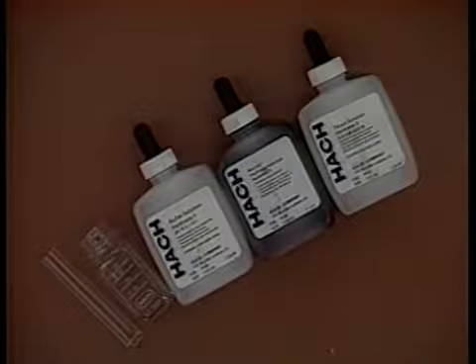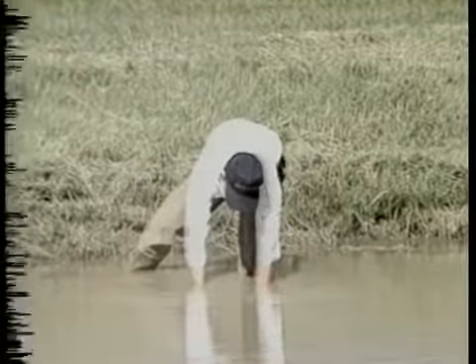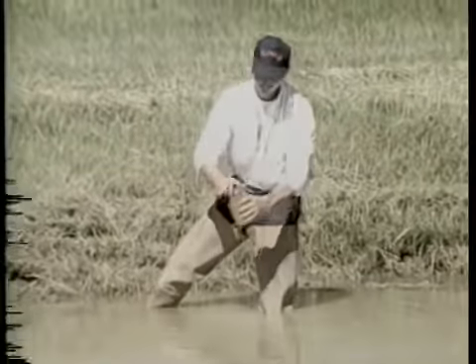Total hardness is measured using a test kit as well. To measure total hardness, proceed as follows. First, obtain a water sample from the pond in the same manner as the alkalinity test. Remember, use a clean sampling jar or bottle.